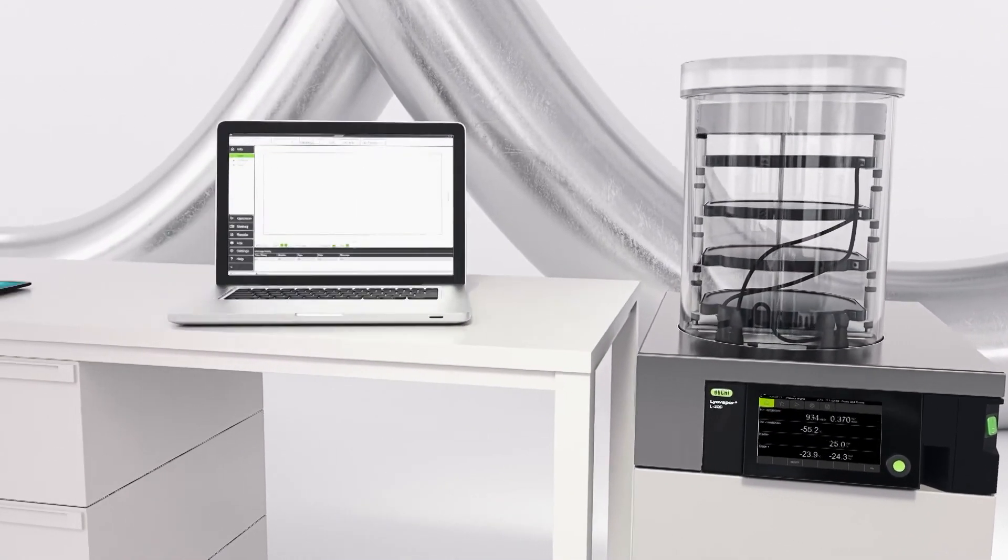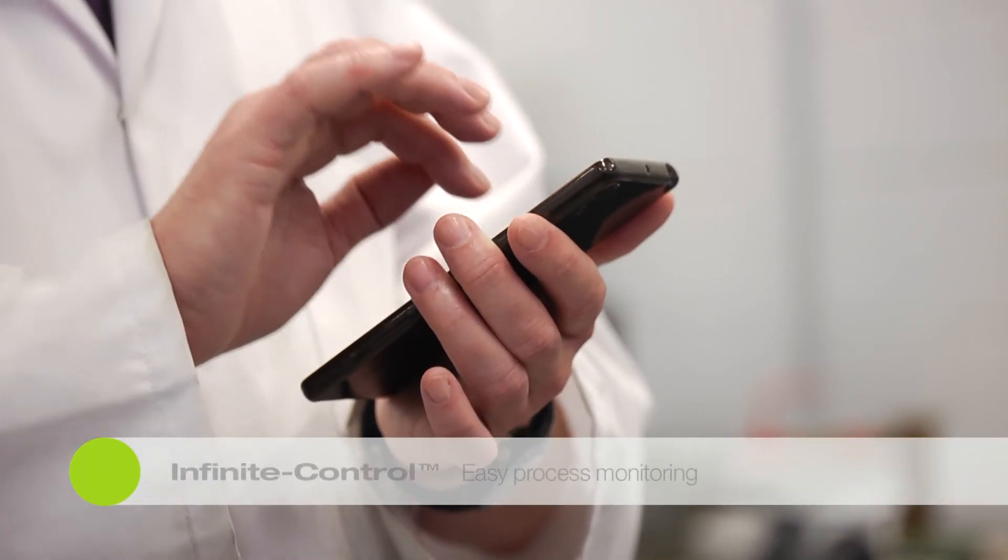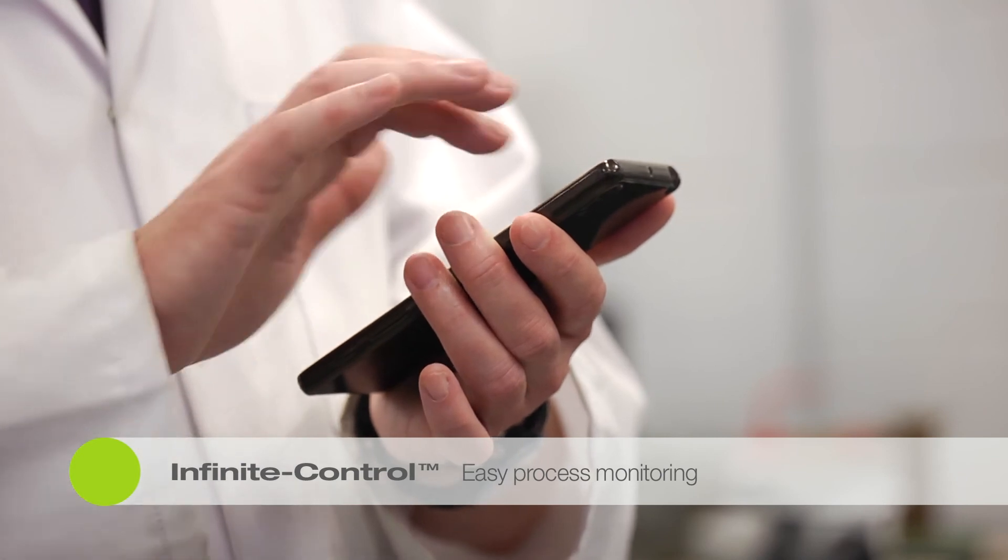Using infinite control technology, the entire process can be remotely controlled using either a laptop or mobile phone device.